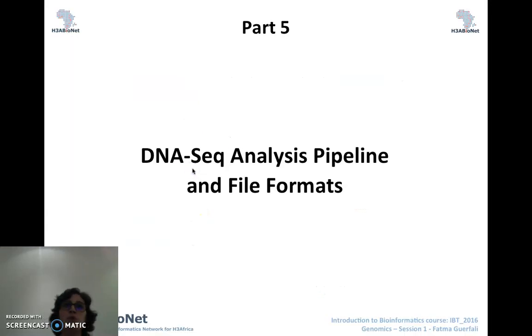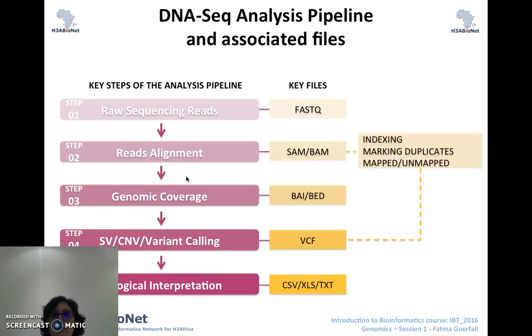So now that you hopefully have generated your library and that you have sequenced, of course, what you would like to do is to analyze your sequences. So here is the analysis pipeline and the file formats that are associated to it.